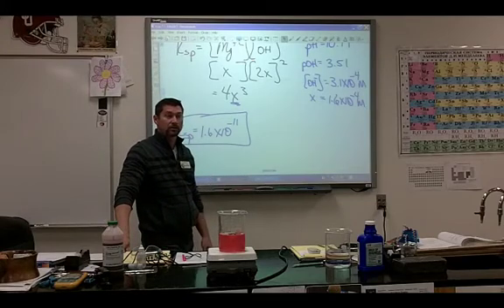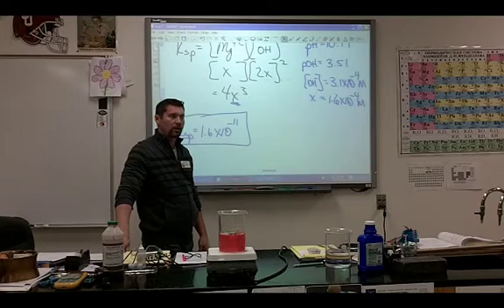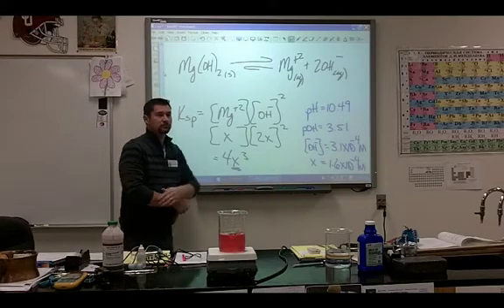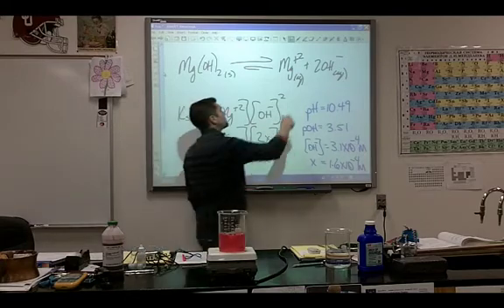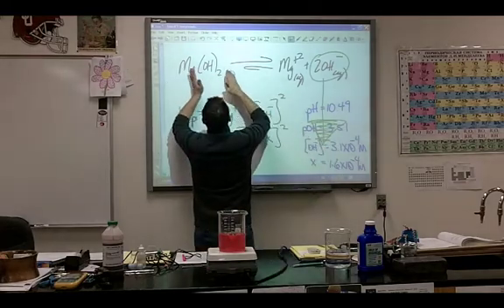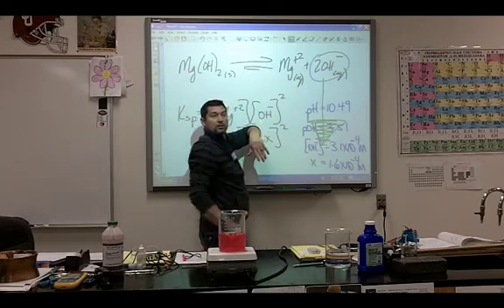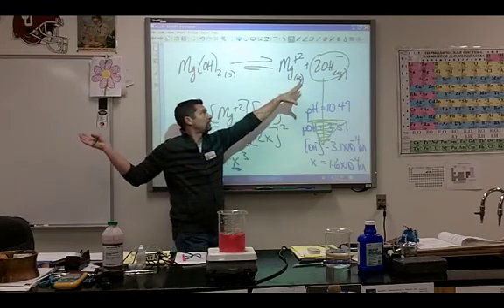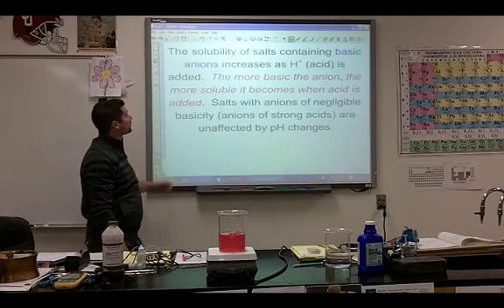Other than the fact that it turned pink. Oh, it's a little more clear. It is clear, isn't it? Yeah. Matter of fact, I don't know from where you're sitting, but I can see the magnet now. I can. Yeah. Okay. Why? Let's go back up here. What's going on? I'm adding H, which is reacting with who? OH. OH. So I'm taking this out. Therefore, this equilibrium is now shifting this way, and you just said it becomes more soluble. So it's less saturated. It's less saturated, right. So it's clear. Does that make sense? It was over here, insoluble. I added something that took that away, which forced it to go this way to become soluble. All right. So here we go.